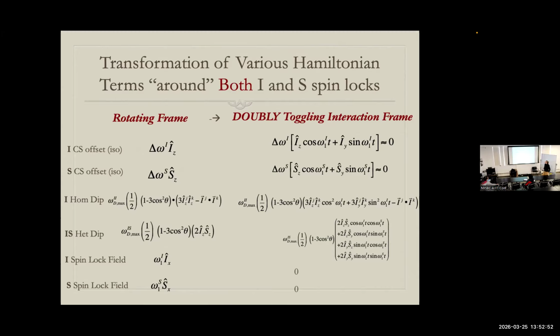Yes, thank you, invariant. So if I have ones on the diagonal and I try rotating that, not so much happens. But the IZ becomes a sinusoidal variation between Z operators and Y operators. That's an important one. This one is also important, but much easier.